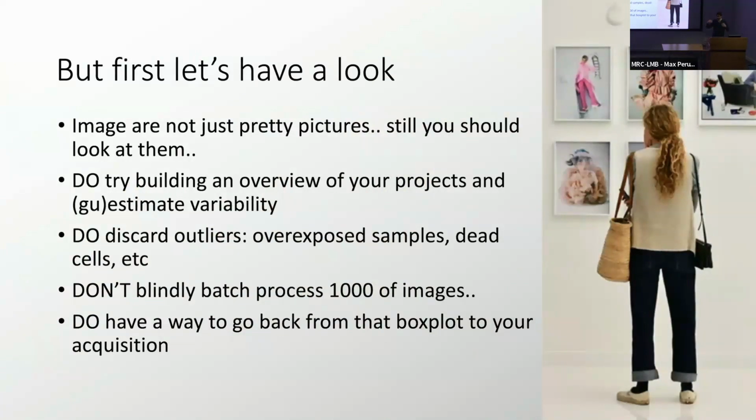Our visual cortex is very good at understanding what's in a picture, it's what it's doing all the time. We can trust it to get an idea of whether this will work. Is there information in my data? Is it not just clutter? So this is important to build an overview of your data set.